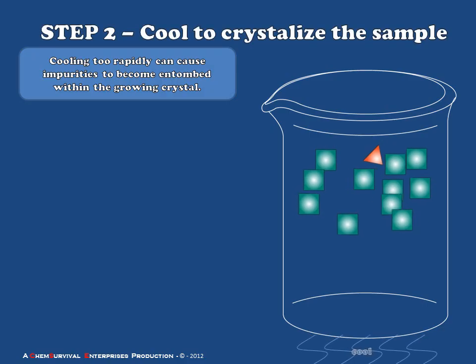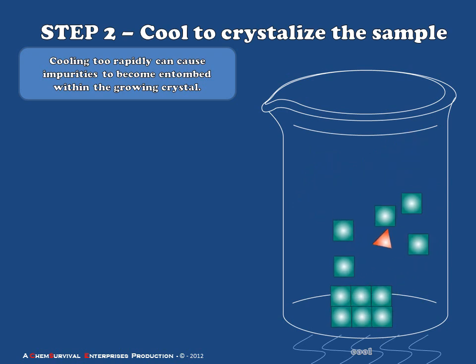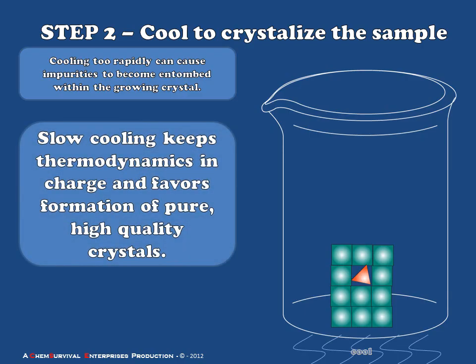So let's cool rapidly and see. Notice that as we cool this mixture rapidly, impurities which might otherwise fall off the face and not be entombed in a crystal are instead trapped because the face is growing so rapidly that new molecules of the desired compound come in and essentially encapsulate it at the surface. The result of this is an impure crystal and this is not the goal of recrystallization. Therefore, slow cooling is essential during the recrystallization process because it keeps thermodynamics in charge, favors the formation of pure high quality crystals, which we can use then for either further experimentation or identification by melting point, which will be the topic of our next segment.